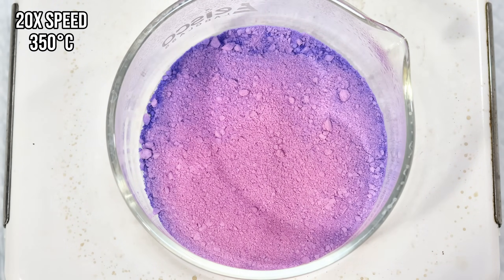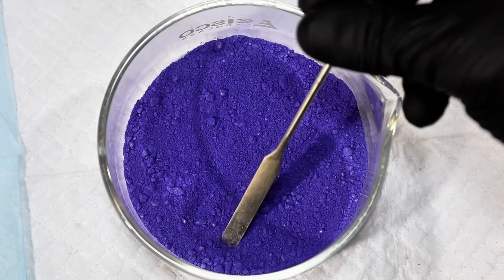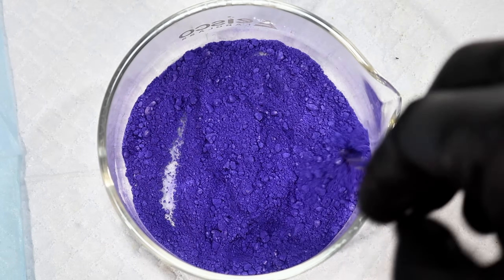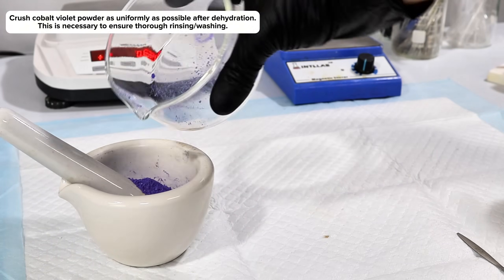I then ramped up the heat to around 350 degrees Celsius and held it there until all of the pink had completely shifted to a deep violet. At this point, I went ahead and cut the heat, allowed it to cool down to room temperature, and then crushed up my now anhydrous cobalt phosphate even further using my mortar and pestle.